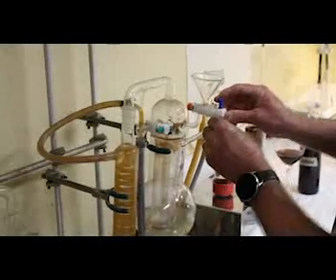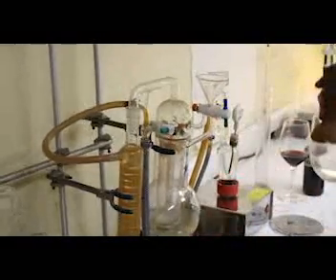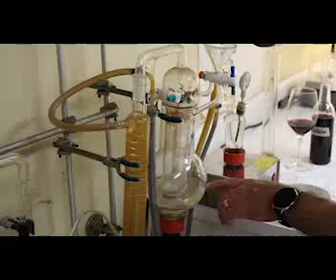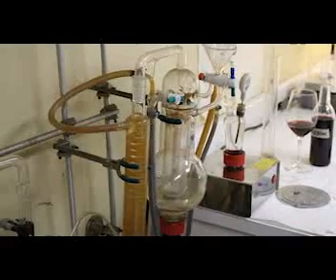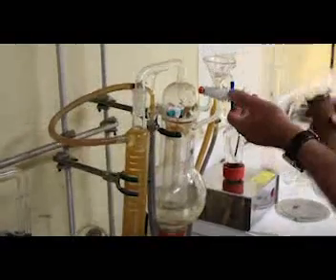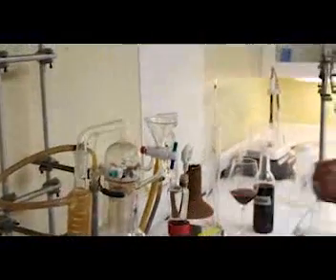And in the meantime, I'm turning this petcock to the point where it allows water into the boiling bath, and I'm filling that back up to a mark about right here. It uses a little bit of that boiling water every time we use it, and you want to keep that filled up about half full. Okay. Now she's set up and ready to roll for the next sample.